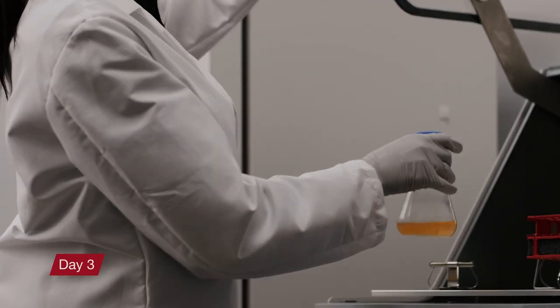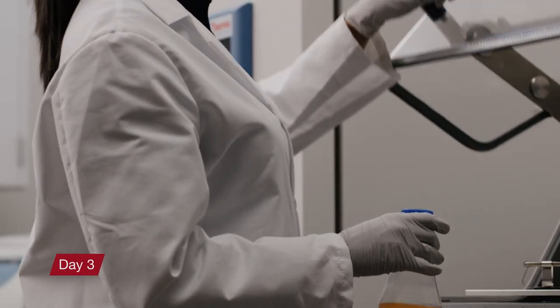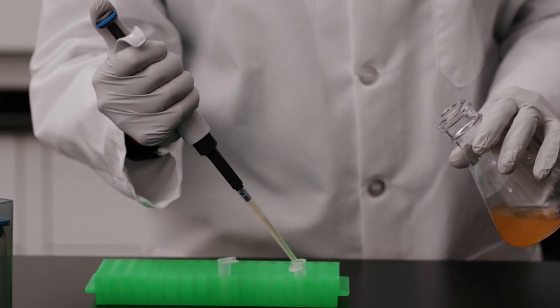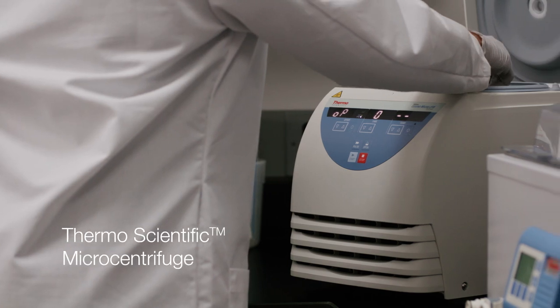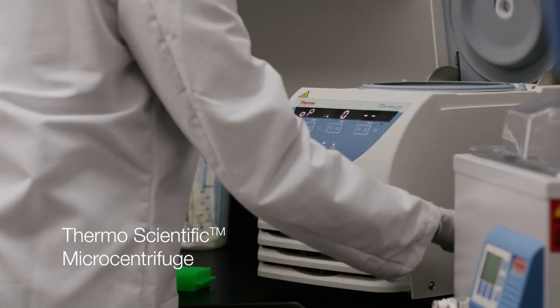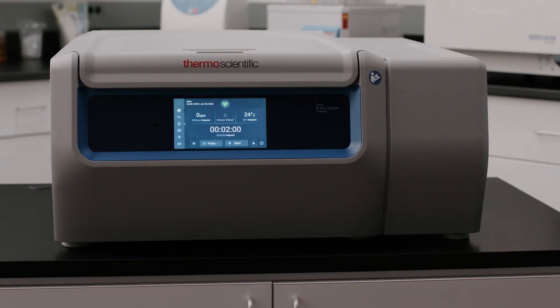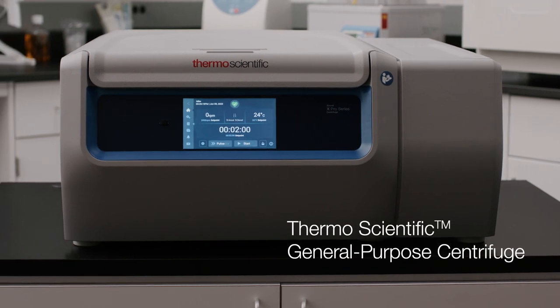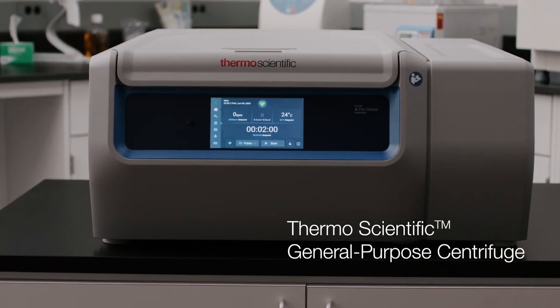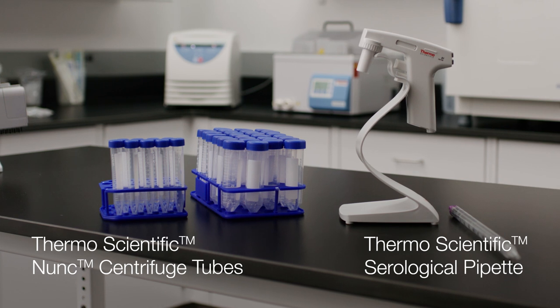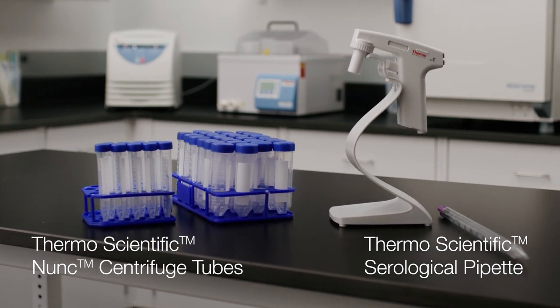The following day, Maria begins her DNA mini prep using small-volume ThermoScientific microcentrifuge SnapCap tubes and an F1 ClipTip pipette and tips. If she was developing a maxi-prep, she would have used a ThermoScientific general-purpose centrifuge with ThermoScientific Nunc centrifuge tubes and ThermoScientific serological pipettes with filters.